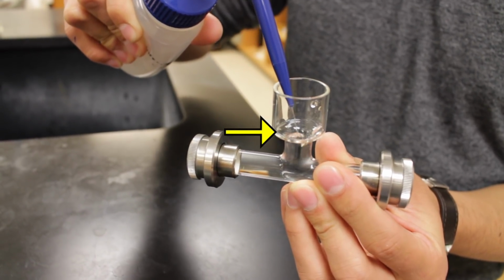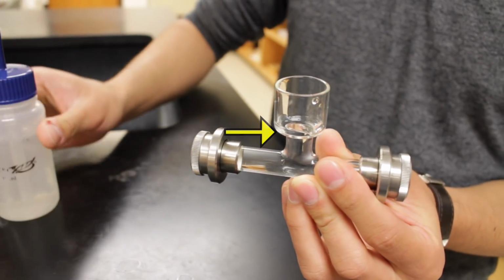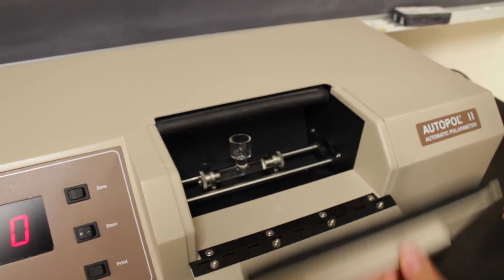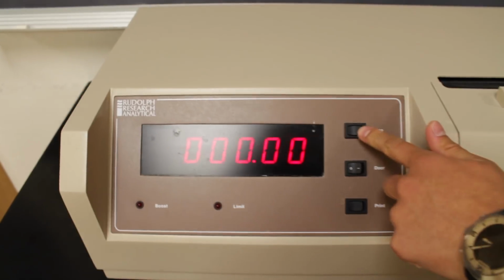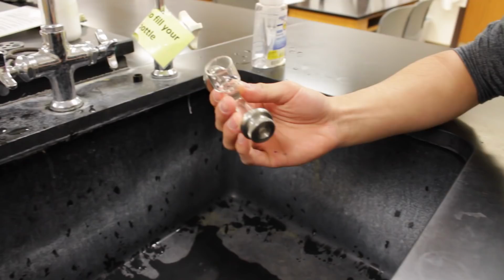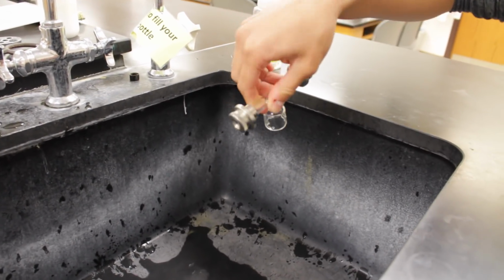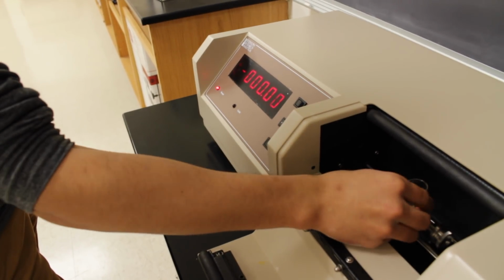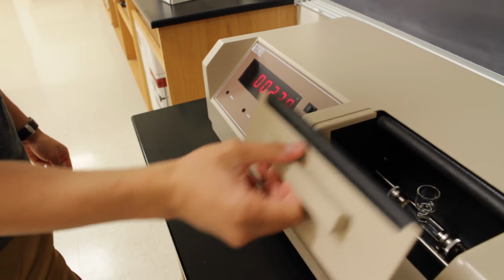Fill the cell with distilled water to at least the bottom of the cup. Place the cell in the polarimeter carefully, close, and zero the polarimeter. The number on the polarimeter should be 0. Dump the distilled water carefully and add the test solution into the cell. Place the cell, and it automatically reads and shows the number on the polarimeter.